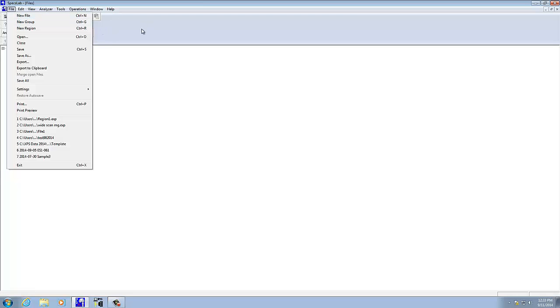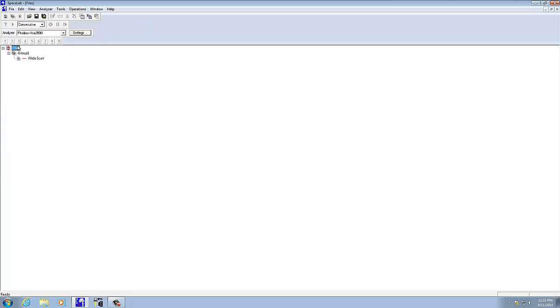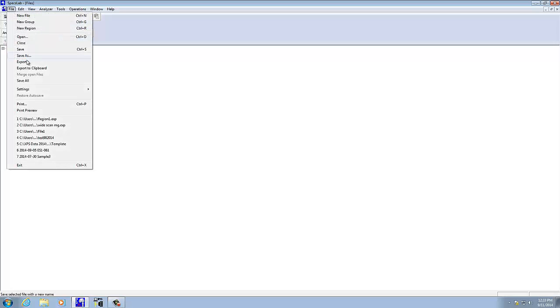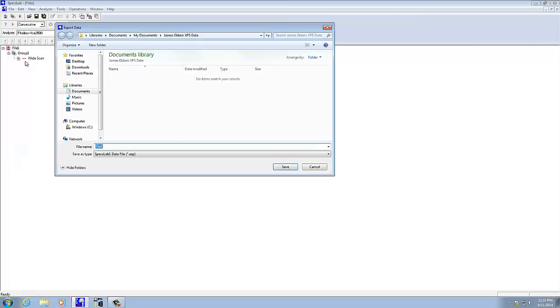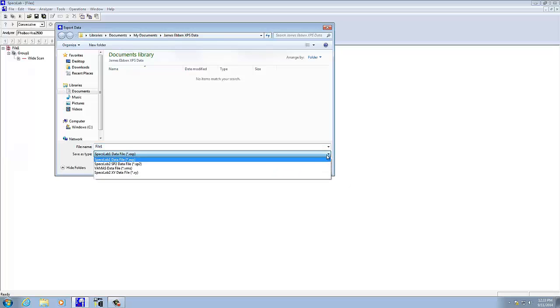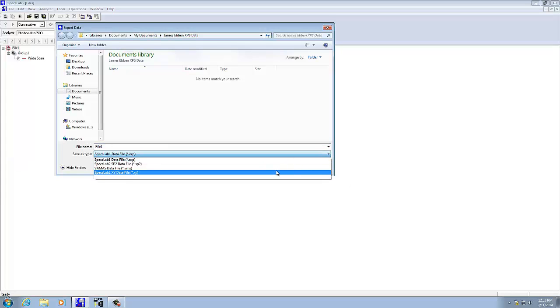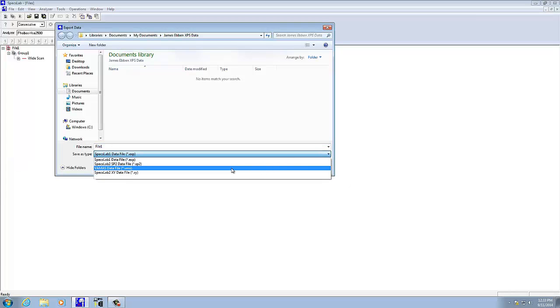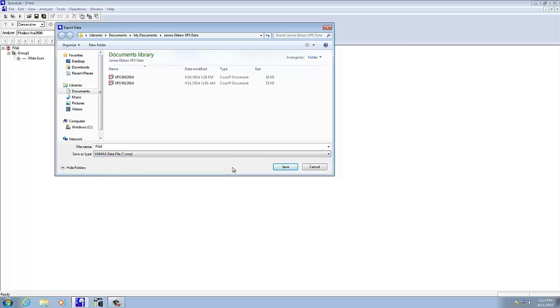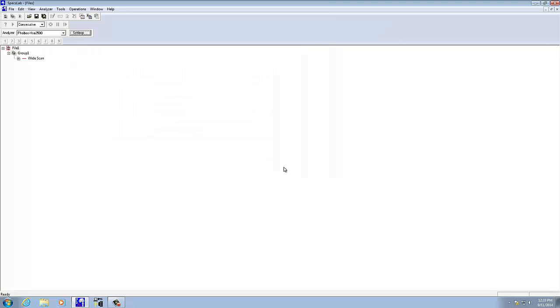The file name has to be highlighted, then you do file, export, and then select down here .VMS, and then that will save it as a VMS file. That can be imported into CASA XPS, so let me go ahead and save that.